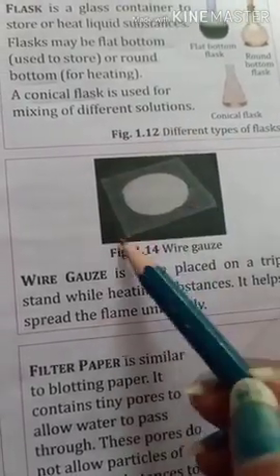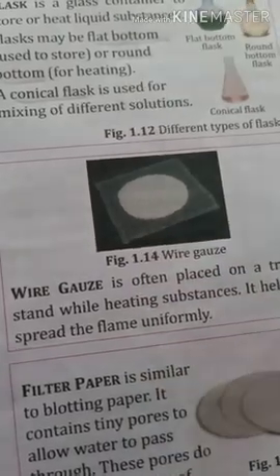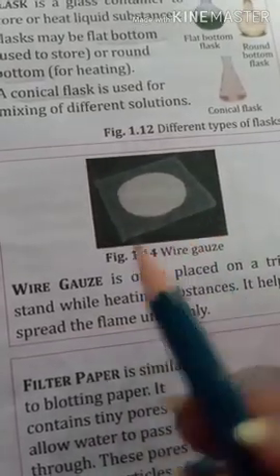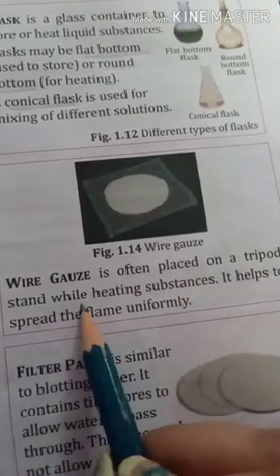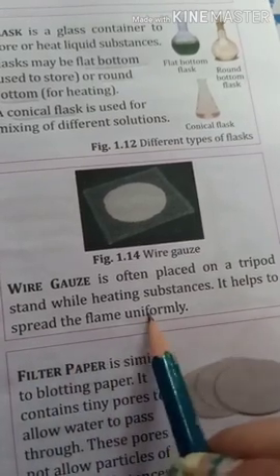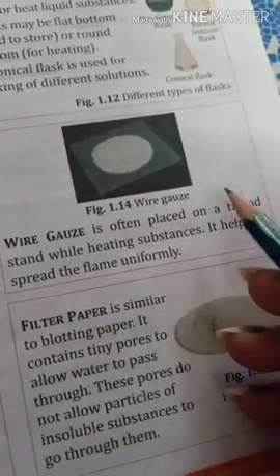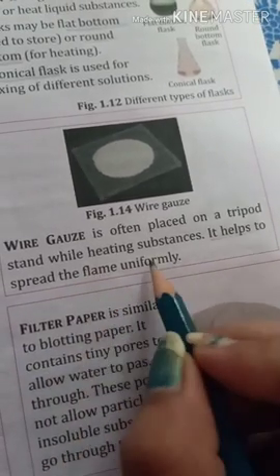This is a wire gauze. It is made up of iron wire, and this wire gauze is often used on a tripod stand while heating substances. It helps to spread the flame uniformly. So the main function of wire gauze is that it helps to spread the flame uniformly.